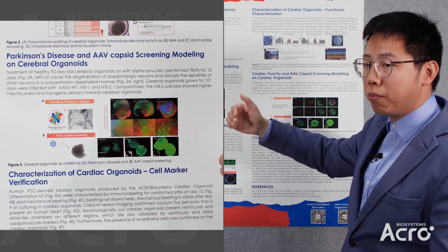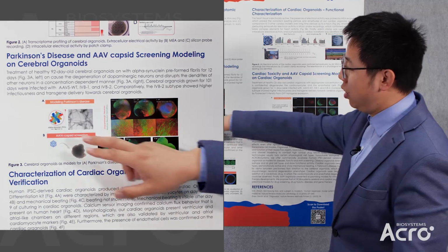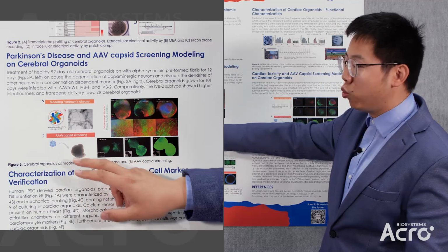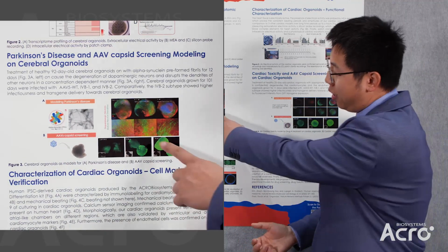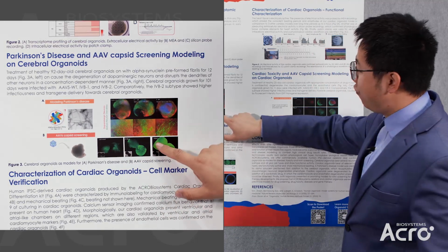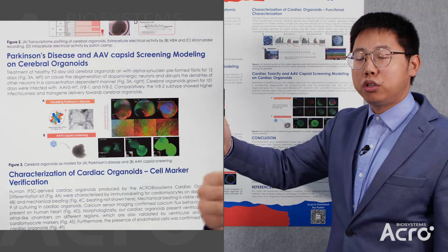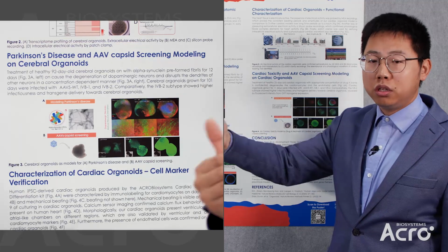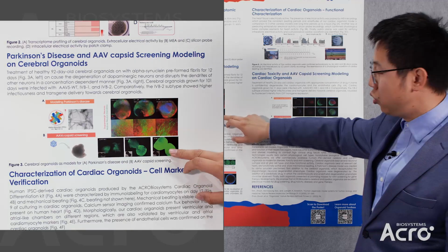They are 2 different modified versions by our partners. And the gene incorporates EGFP to show the markers. And you can clearly see the difference. The IVB2 has the highest delivery efficiency to deliver the target therapeutic genes to the cerebral organoids.